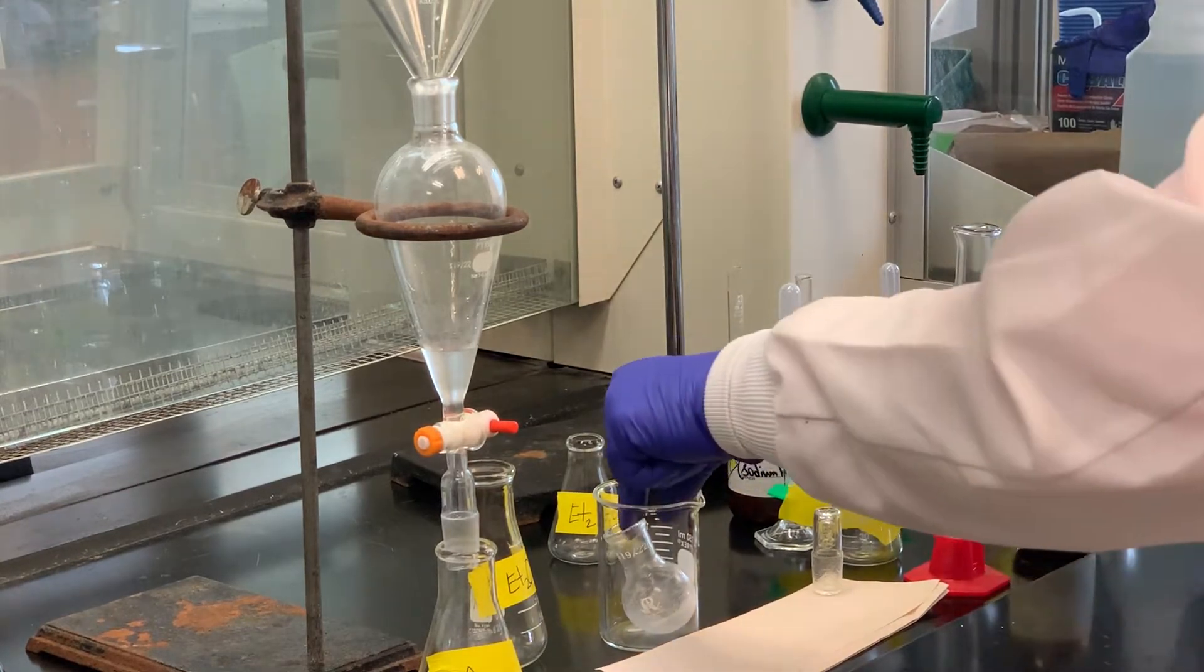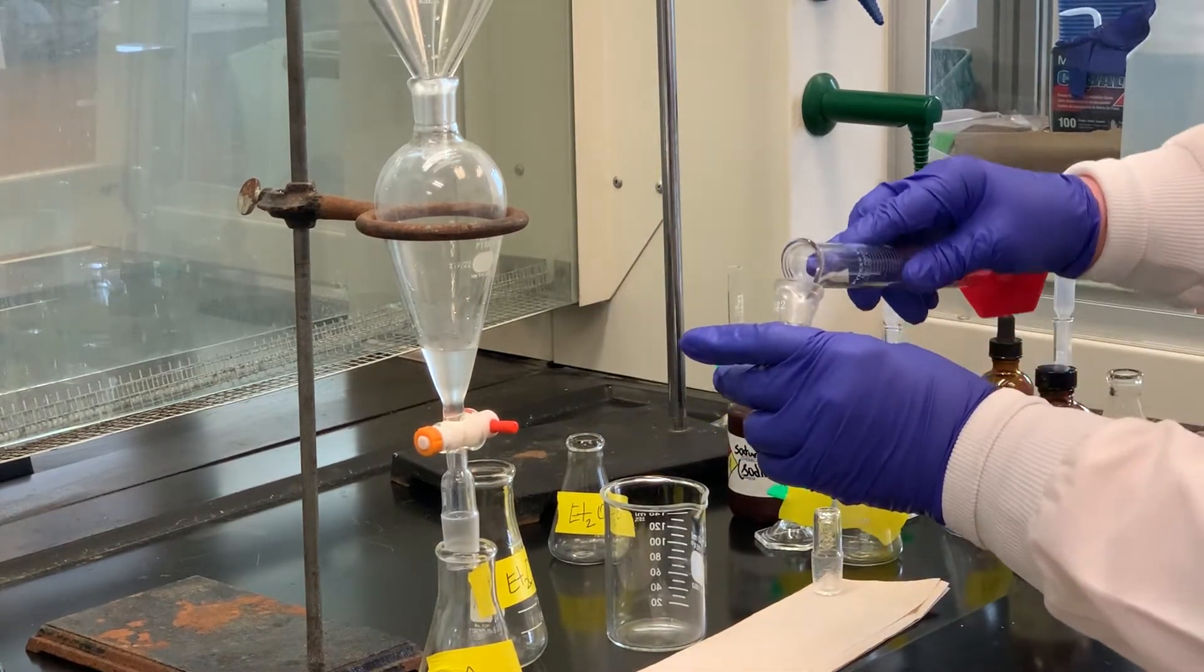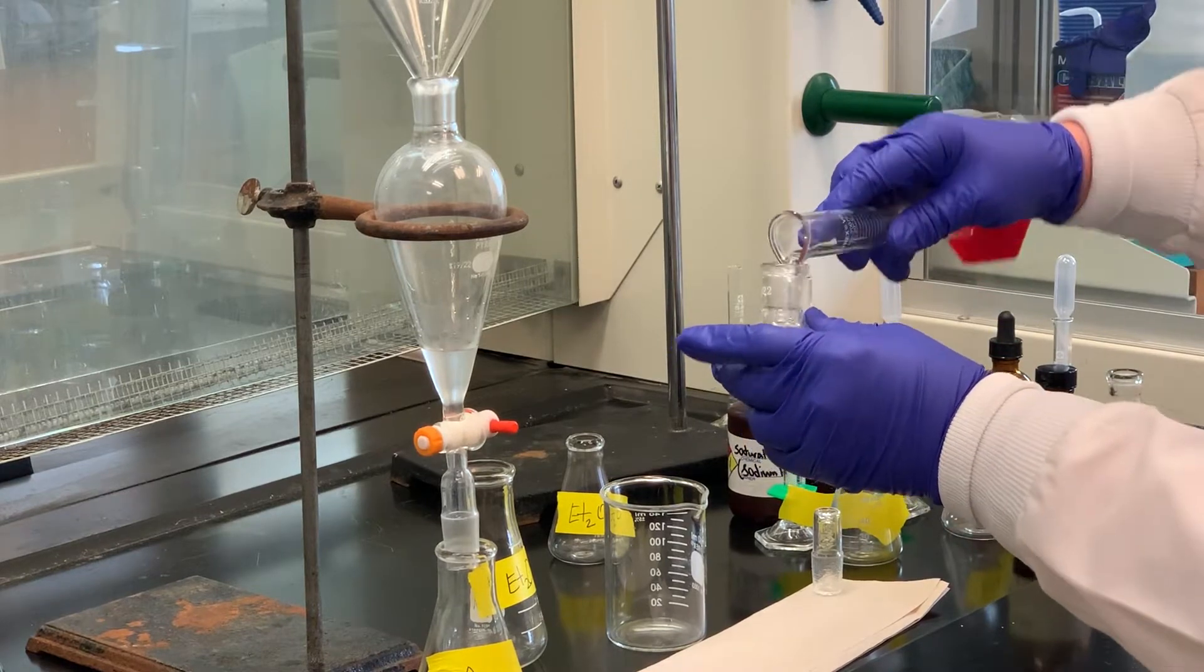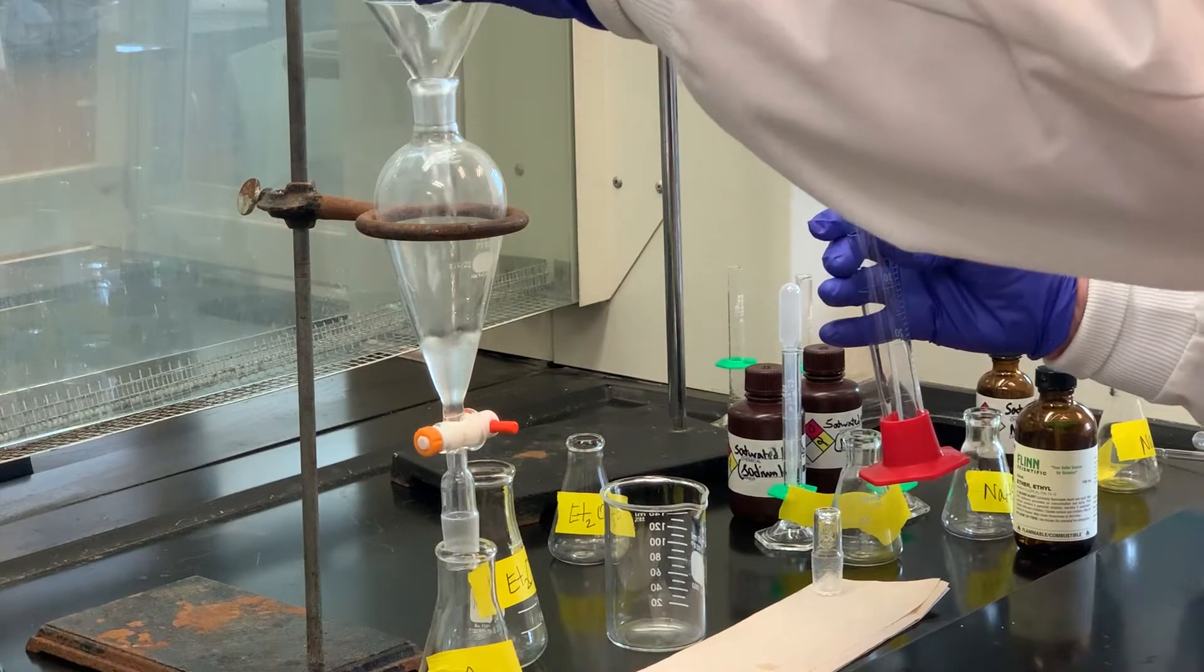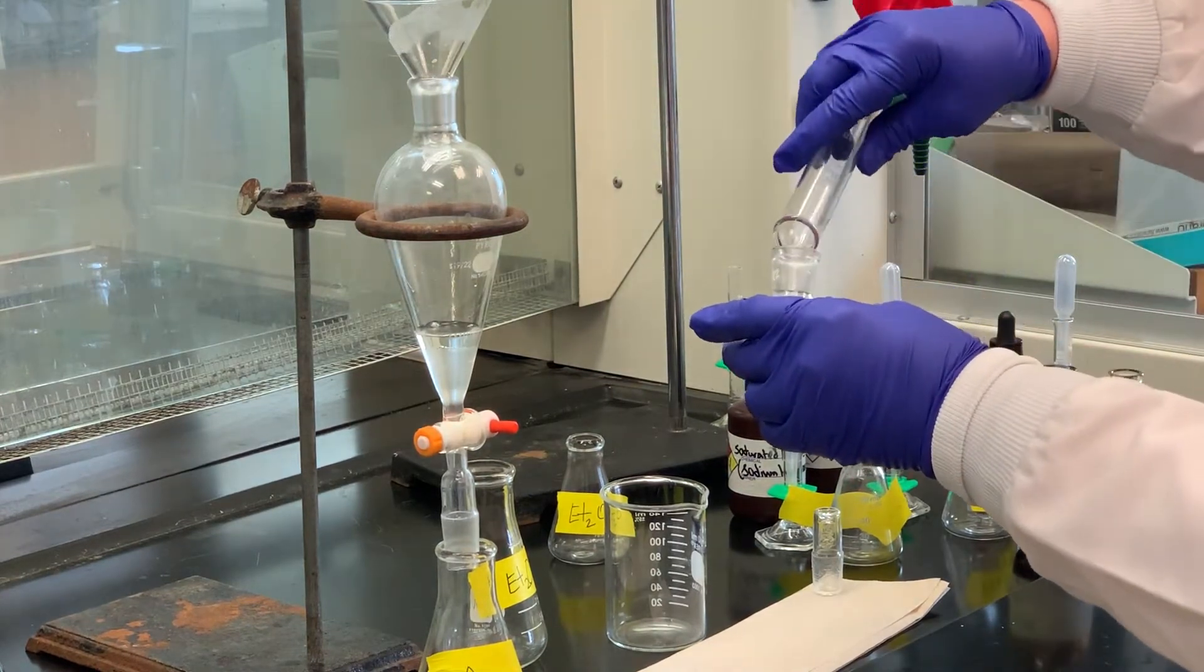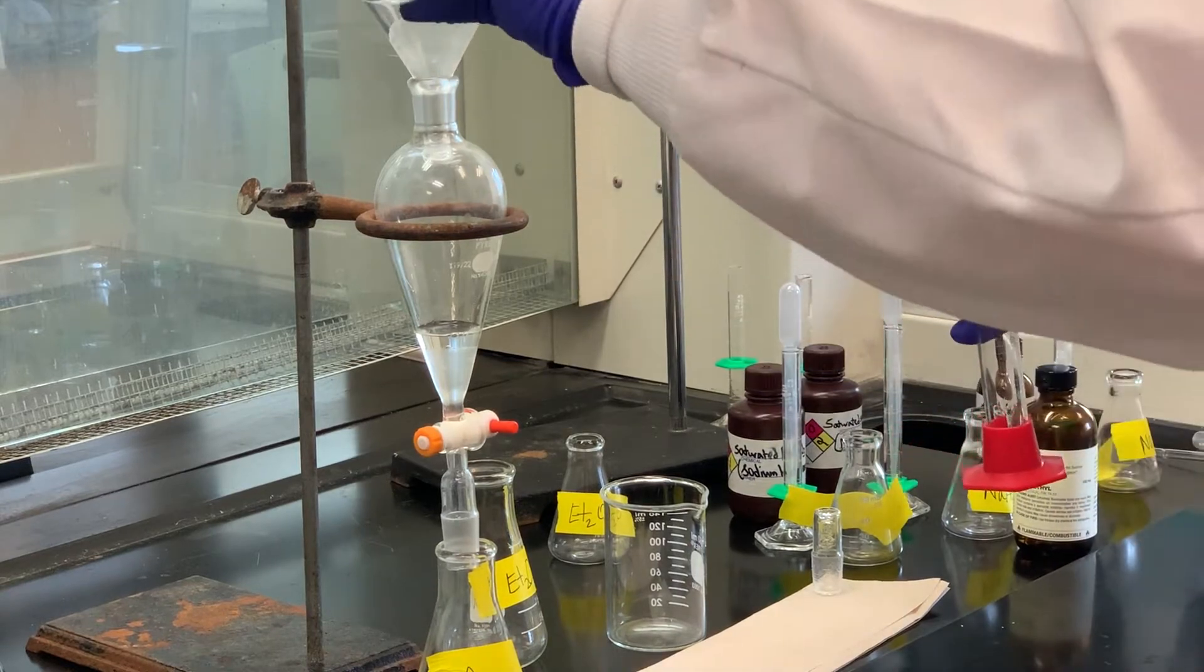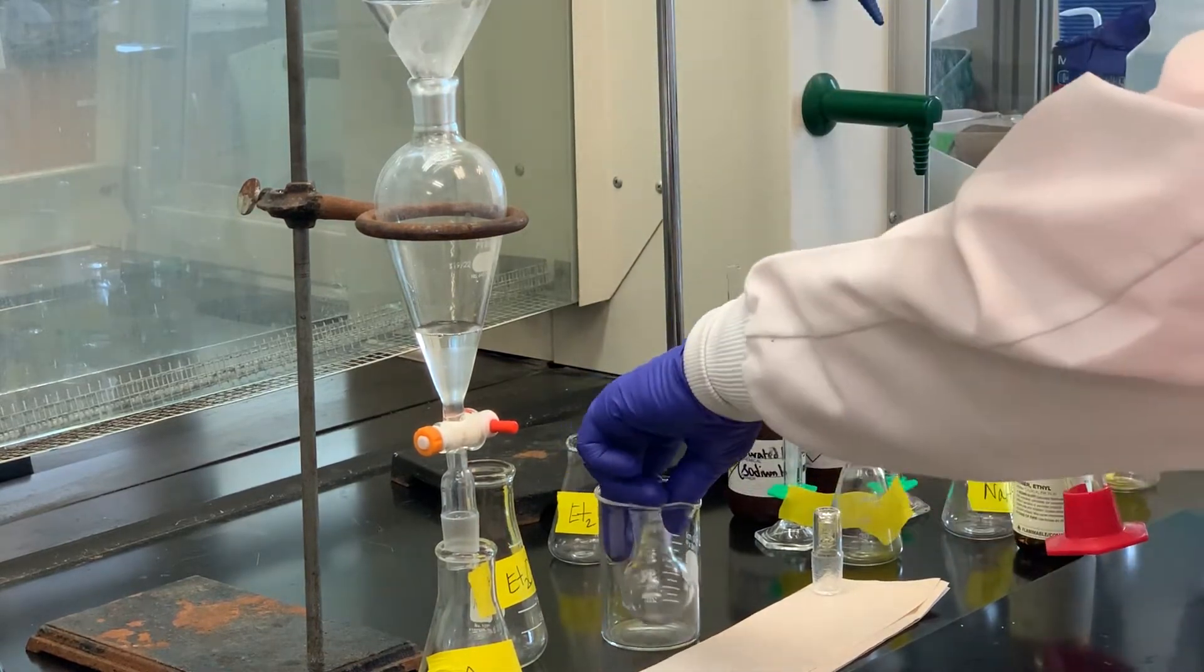And I think what would also be good is because I have some product that crystallized as soon as I poured it into the separatory funnel, so I'm going to use the ether to wash that out as well. All right, so I'm done with that round bottom flask.